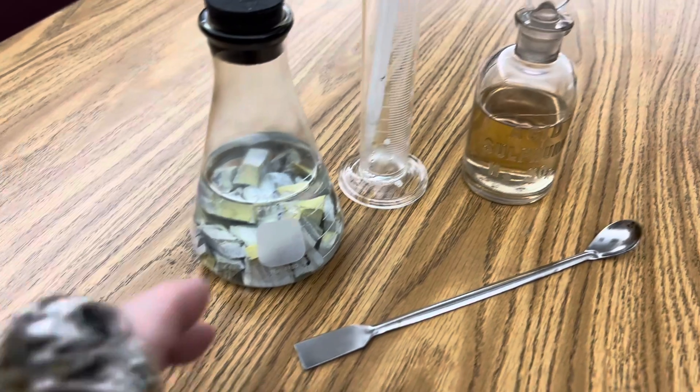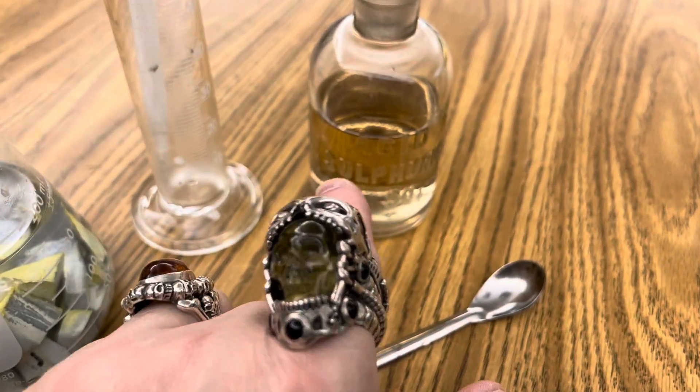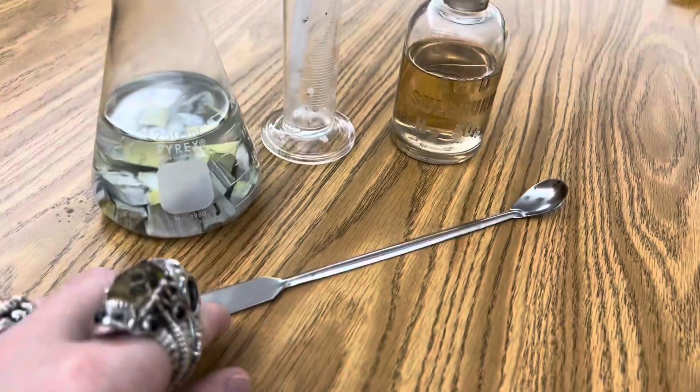All you're going to need for this reaction, of course, is your elemental potassium, 18 molar concentrated sulfuric acid, a graduated cylinder dropper, and a spatula.